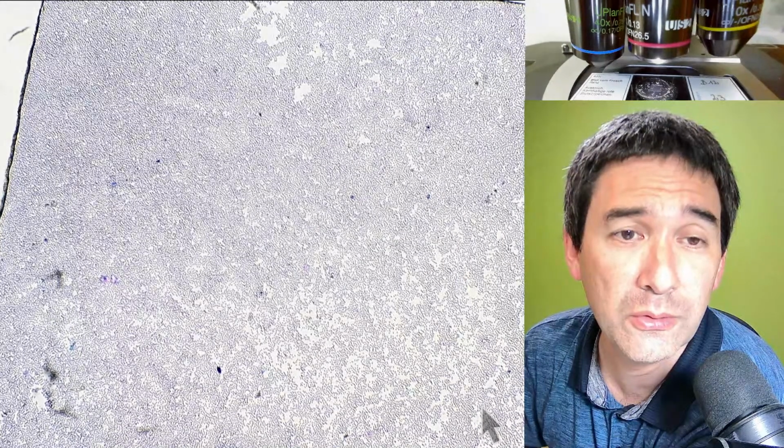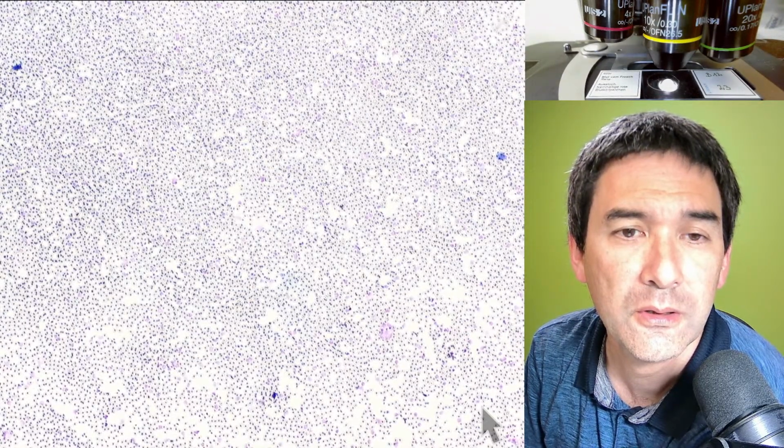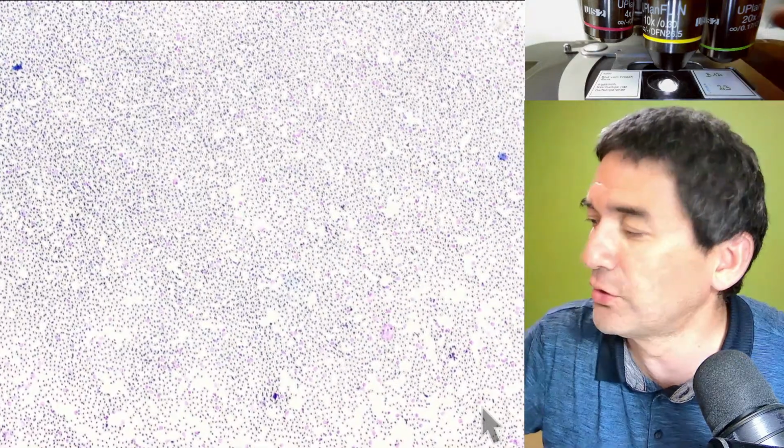Just to illustrate this, let's go down here to the 4 times. This is the 4 times, remember? Let's go a little bit higher, let's say the 10 times here. So what's the point of switching magnifications using the objective, if all I can do is just make it larger like this? Of course I can do that, but you're not going to see more. If you want to increase the magnification, you have to do this with the objective, because then you're actually able to see more clarity.